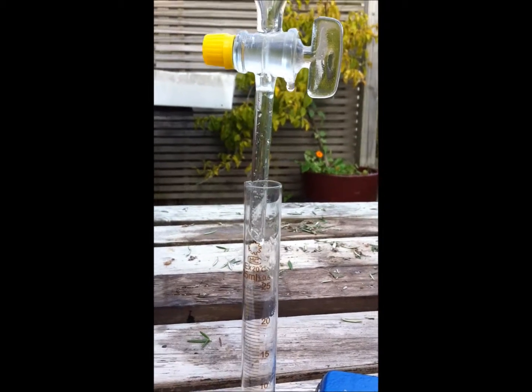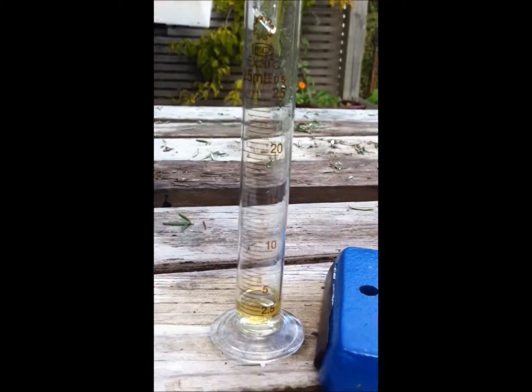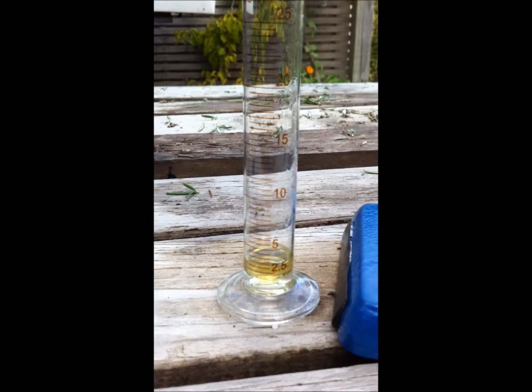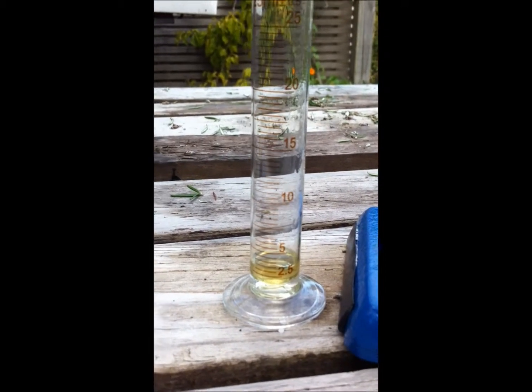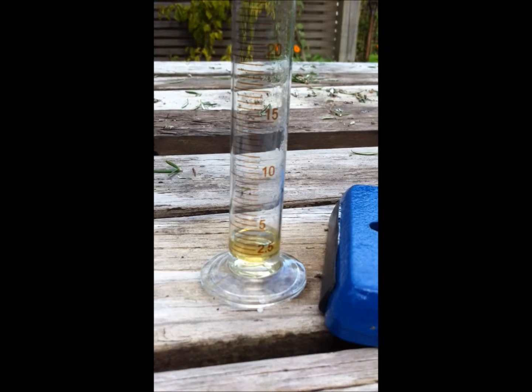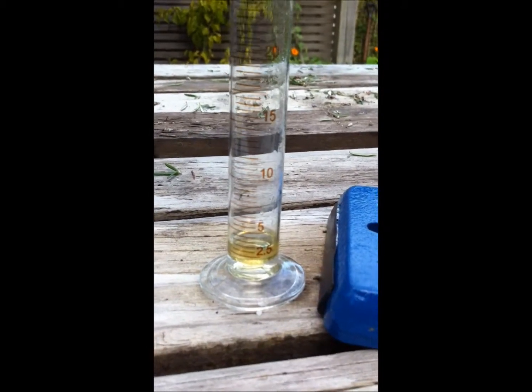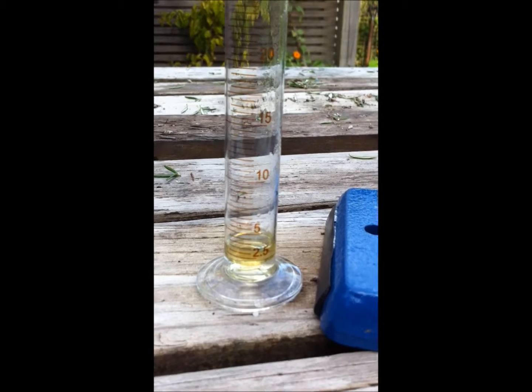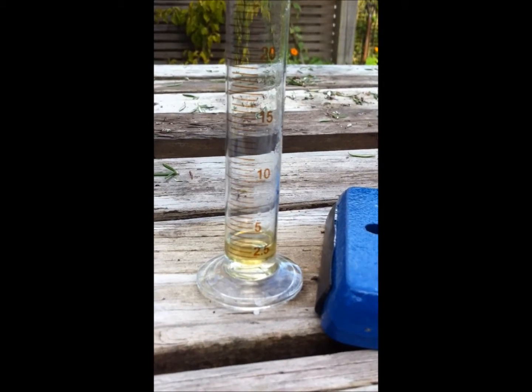That's my yield of essential oil from 500 grams of rosemary. I'll put it into a smaller measuring glass for an accurate measure. I've drained the essential oil into a small measuring flask and I've got exactly 2.5 mils. That means four columns will give me my 10 mils total, and I think I've got just about enough rosemary. It took about half an hour to distill the 500 grams and I'll also have 500 mils of quite strong rosemary hydrosol.